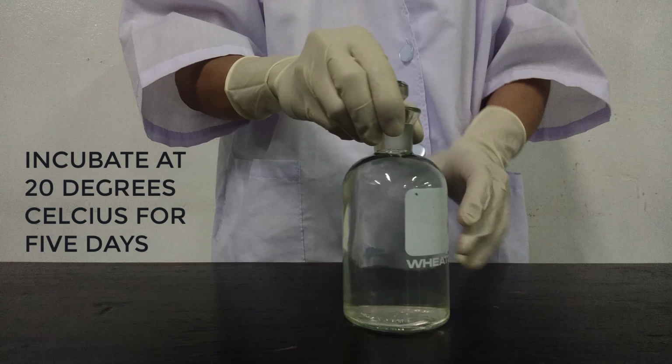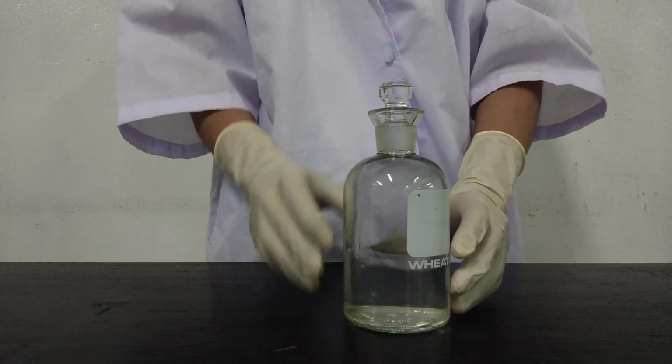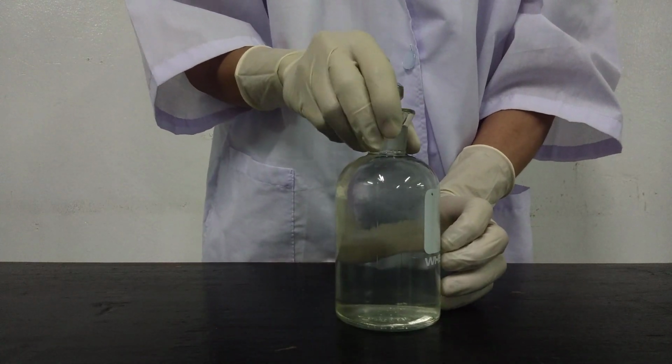Now for the second sample that was incubated after 5 days at 20 degrees Celsius, we will repeat the same process and we will record it as dissolved oxygen final. The first reading is always your dissolved oxygen initial or the immediate dissolved oxygen.